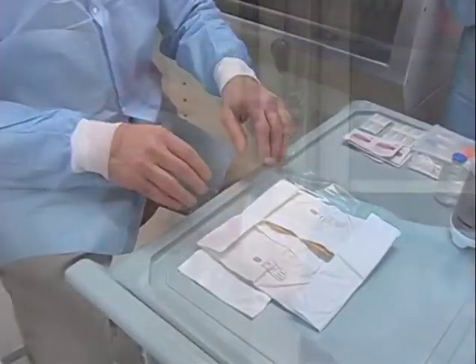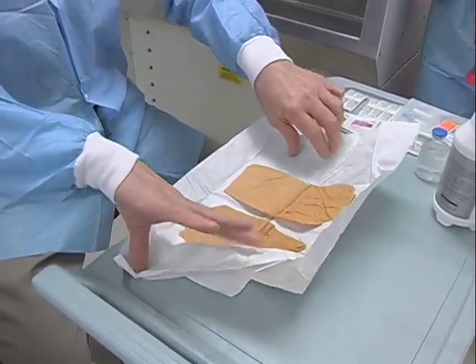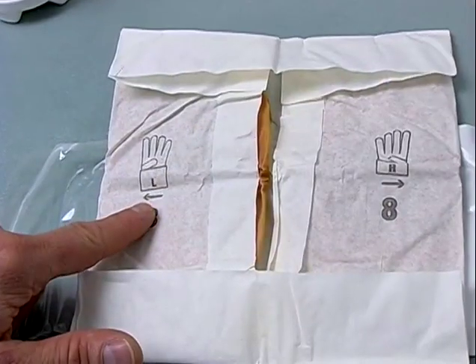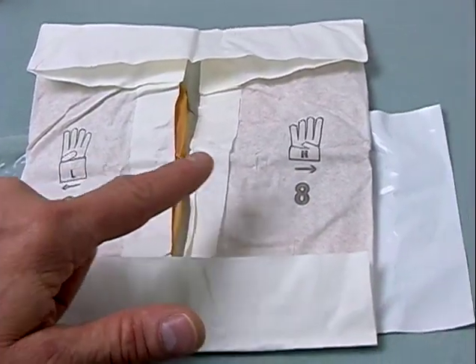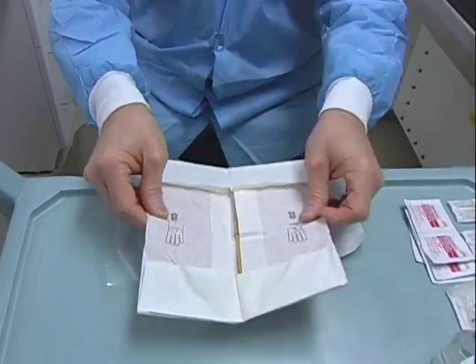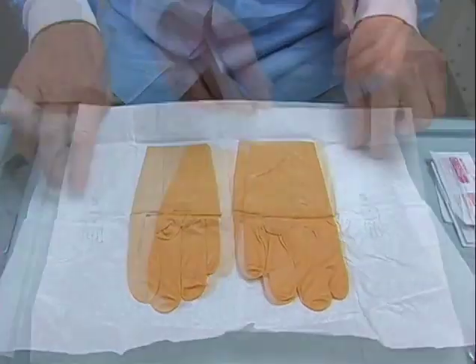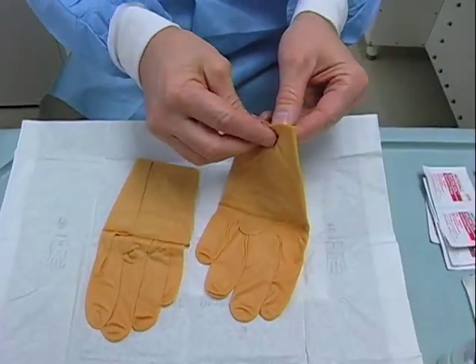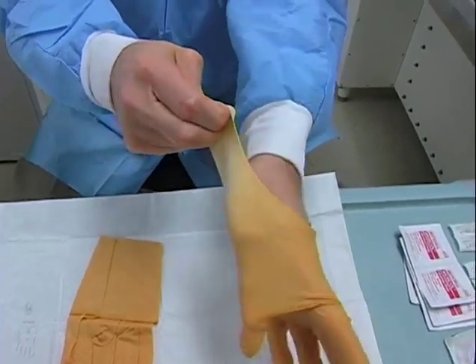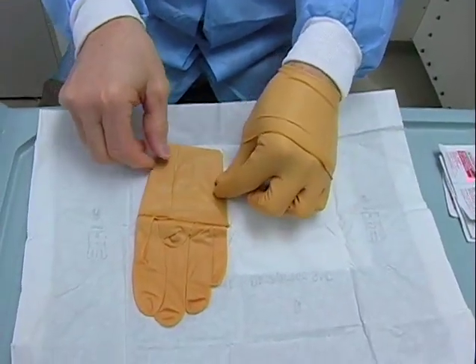In the buffer area, stage the sterile gloves for use. While opening the glove package to access the gloves, take care not to touch the gloves, marked as either left or right, while the sterile packaging is being unfurled. Aseptically open the sterile glove container in accord with the manufacturer's directions. Each glove cuff will be partially folded back to reveal a portion of its inner surface, which may be touched. However, the sterile glove palm and finger areas must never be touched during garbing.